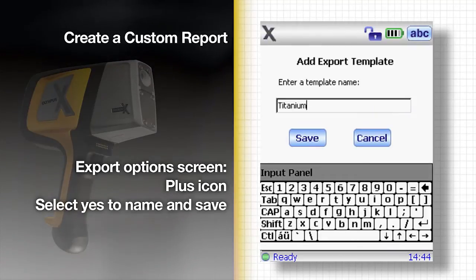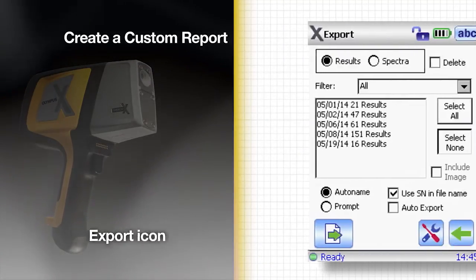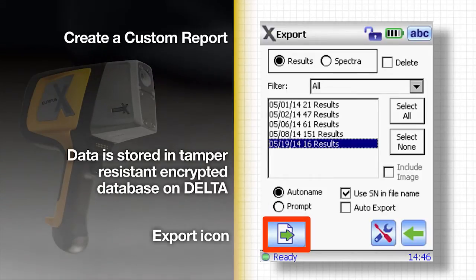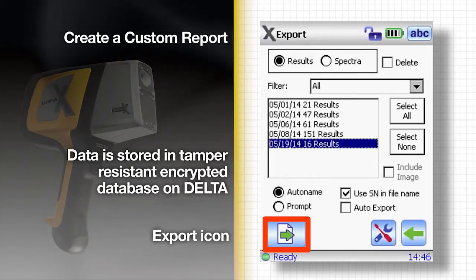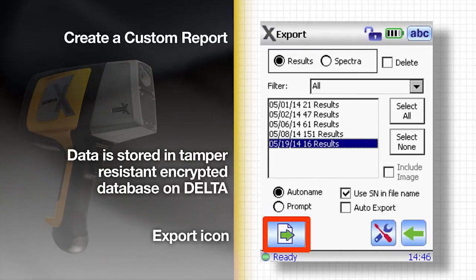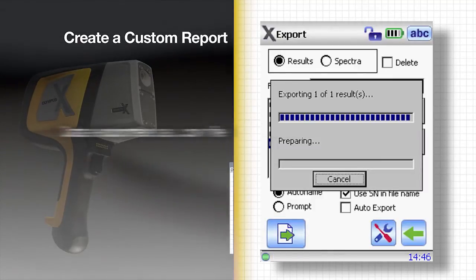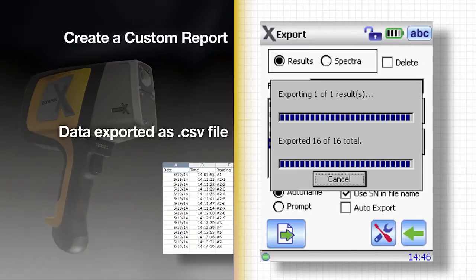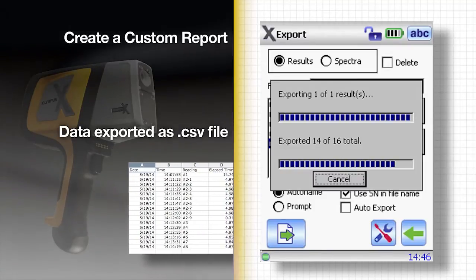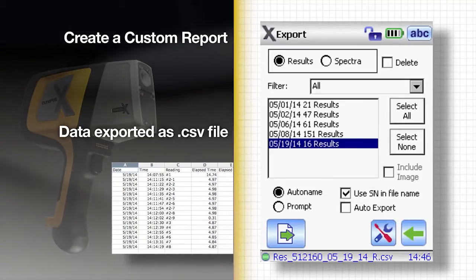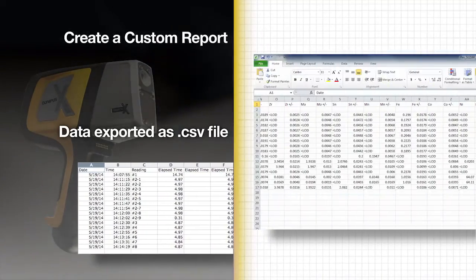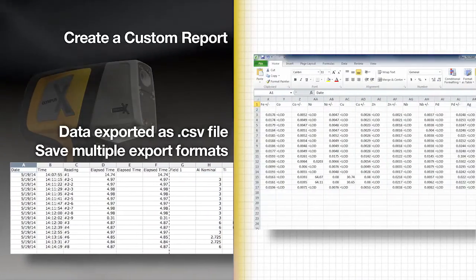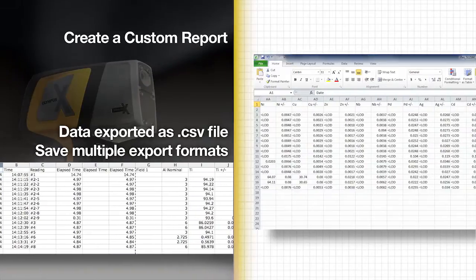Now it's time to export the data. Tap the export icon in the lower left hand corner. The test results are stored in a tamper-resistant encrypted database on the Delta. The data is exported in a CSV format containing comma-separated values, which is easily read by a spreadsheet program like Microsoft Excel. You can save multiple export formats to review test results.